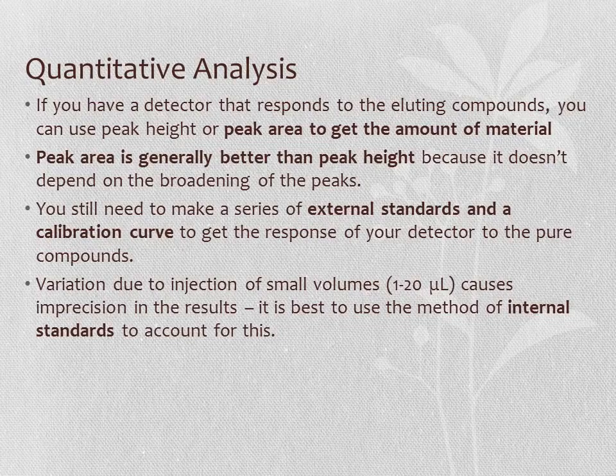You need to do a calibration curve with a series of different concentrations of standards external to your sample, and use that to get the response of your detector to the compounds. Also, it's very, very common to use internal standards to account for the variation in sample volume that you inject. This is because you may have a set injection of 20 microliters, but it might vary a little bit below and above that, and you want to know that the change in the area of your peak has to do with the concentration changes, and not to a simple change in how much material was put on the column.